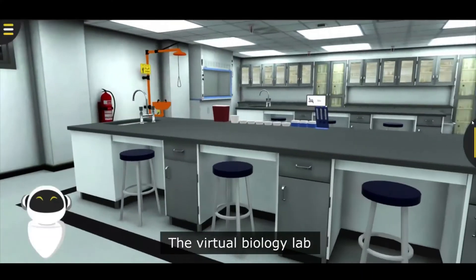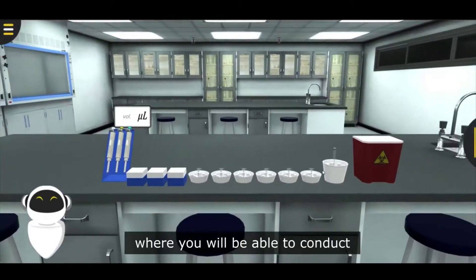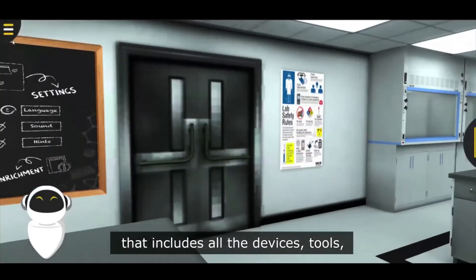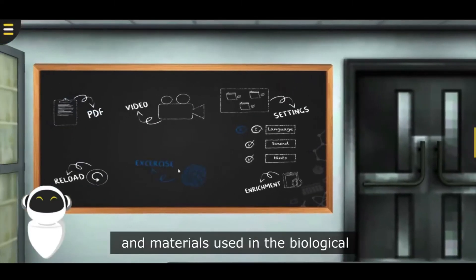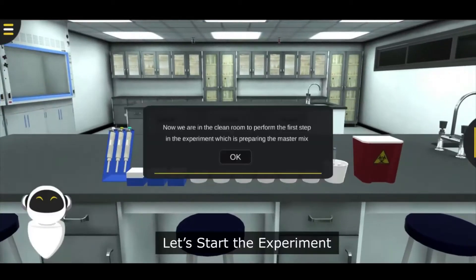The Virtual Biology Lab from Praxylabs provides you with an interesting interactive experience where you'll be able to conduct the experiment through 3D simulation that includes all the devices, tools, and materials used in the biological laboratories. Let's start the experiment.